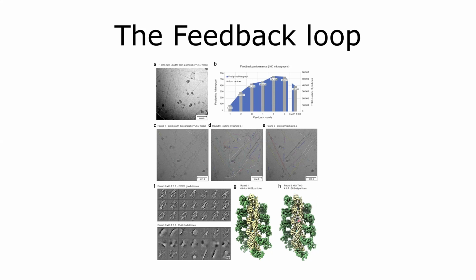And it was definitely enough to identify a small molecule bound here to this actin molecule. Which is sometimes what you want. If you want to see if a ligand or a small molecule is bound or not, you might not want the 2 angstrom resolution, but the 4 angstrom might be sufficient if you have a reference structure at hand.